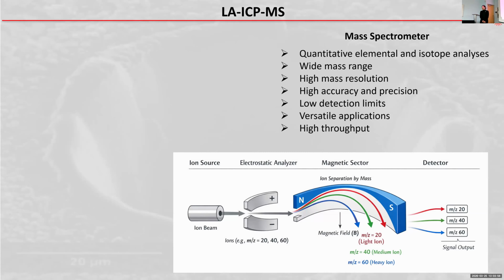It has an extremely high versatility, with an ion source, a mass analyzer, and a detection system. All three components can vary significantly according to the application that you need, to provide high precision chemical analysis, elemental as well as isotopic.